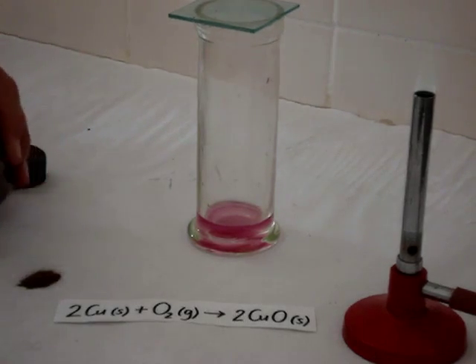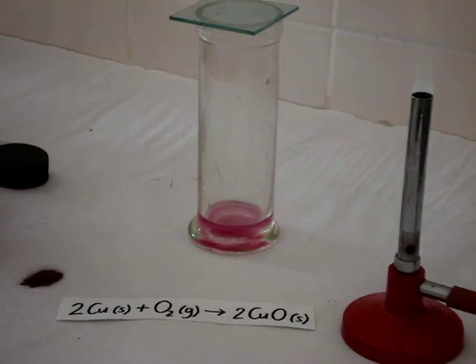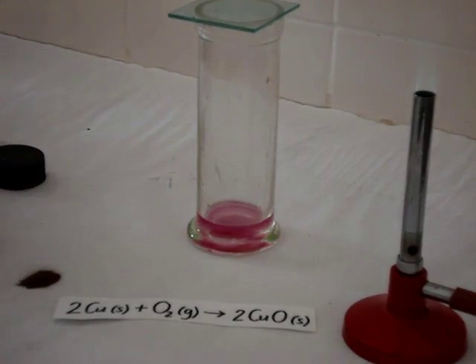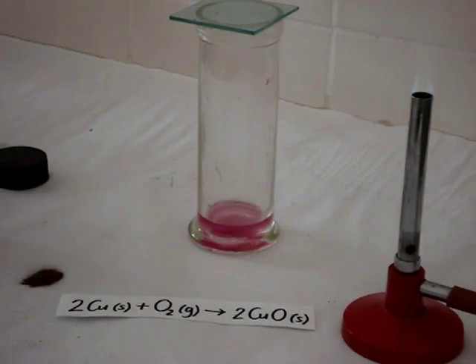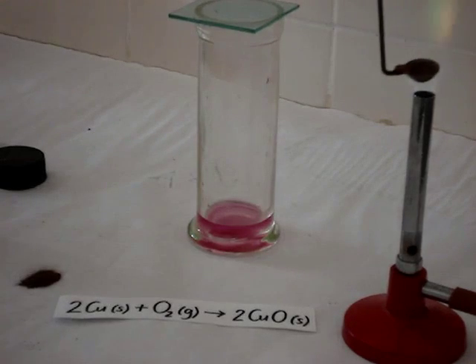We place some copper powder in a deflagrating spoon. The reason why we use copper powder rather than a piece of copper metal is because the greater surface area that the copper powder provides causes it to react faster.